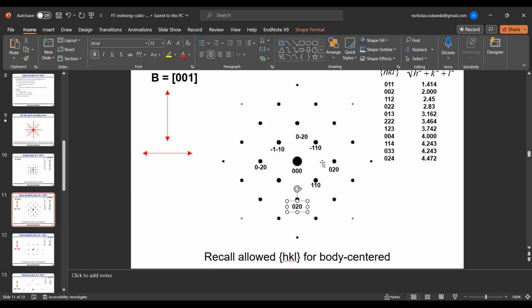Oh, whoops, I did a little math wrong here. Glad I caught this. This should be minus 2, 0, this should be 2, 0, 0. Yep, that's correct. Glad I caught that. Then we switch the indices there. So that's my solution.